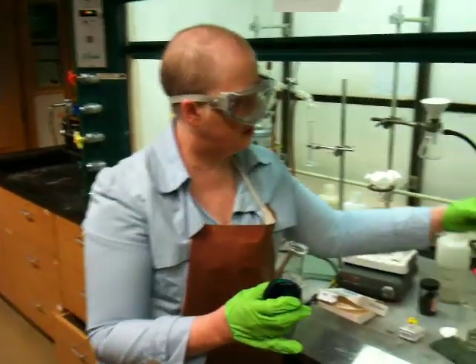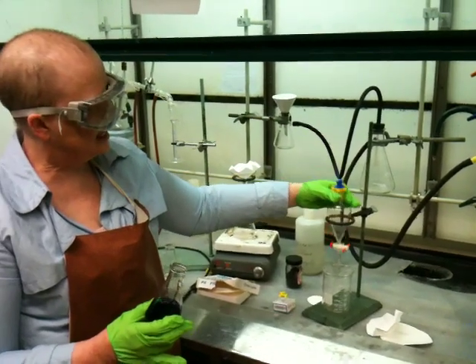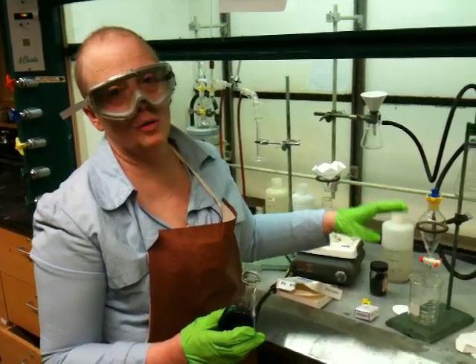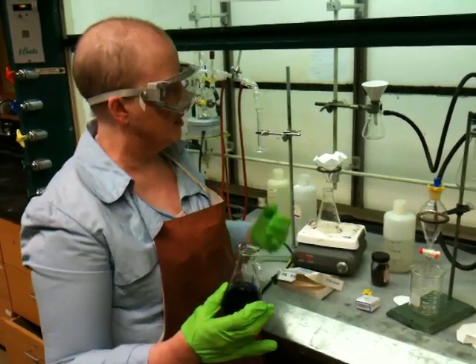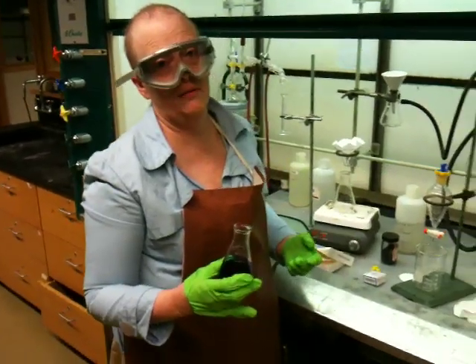To do this, we would use what's called a separatory funnel — and this is a separatory funnel. You have different sizes; I'm using a medium-sized one here. You pick your glassware based on the volumes you're working with, so this is a 125-milliliter funnel. A lot of times you're going to have to make this decision on your own. I'm going to work with about 100 mils of solution, so this is an appropriate volume.